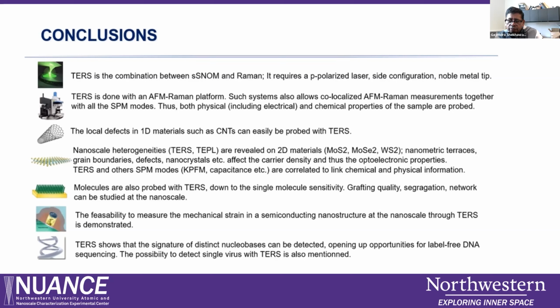I noticed that you have 5 different wavelengths, including 850 nm near-IR laser, right? Yes, that is a lot. So basically, if they want to measure Stokes and anti-Stokes, nanoscale thermometry at the nanoscale, then they can use this system. It's not necessary that you have to do it together. You can do it separately.